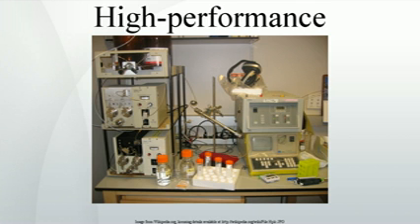HPLC separations have theoretical parameters and equations to describe the separation of components into signal peaks when detected by instrumentation such as by a UV detector or a mass spectrometer. The parameters are largely derived from two sets of chromatographic theory: plate theory, as part of partition chromatography, and the rate theory of chromatography, or Van Deemter equation. Of course, they can be put in practice through analysis of HPLC chromatograms, although rate theory is considered the more accurate theory.